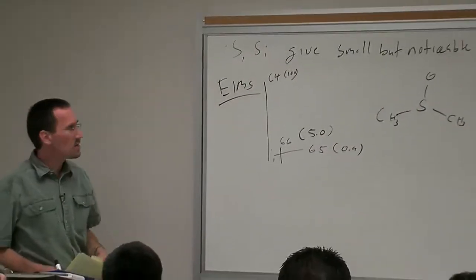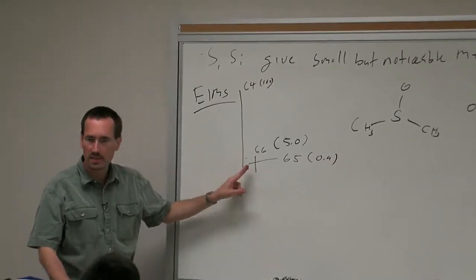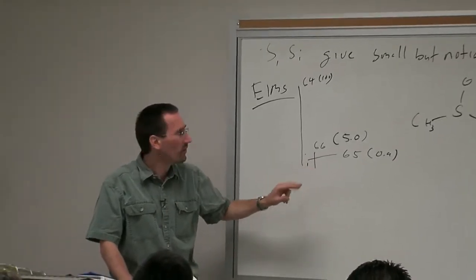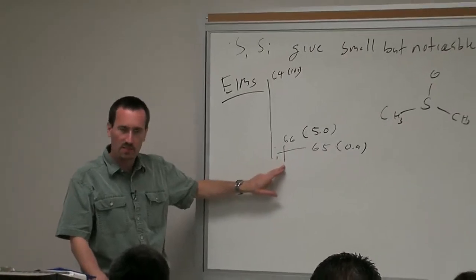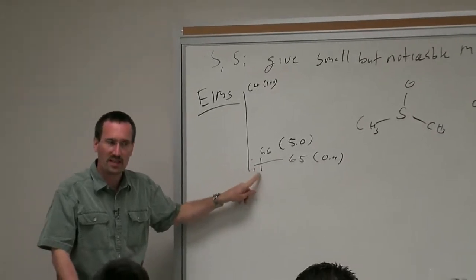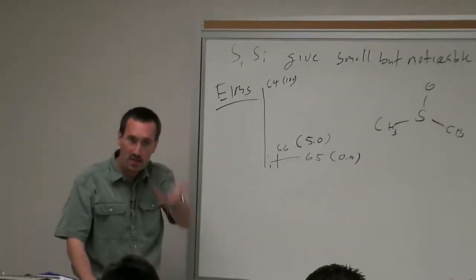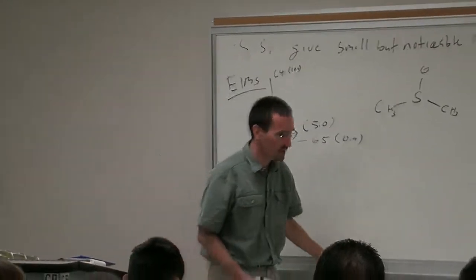So in reality, unless you were doing specific quantitative mass spec for isotopes, which is a whole field in itself, you'd probably just glance at this spectrum and say, hey, I see an M+2 peak, something's up. What fits that mass spec? I bet there's a sulfur or a silicon, and then you'd be scratching your head and coming up with the formula.